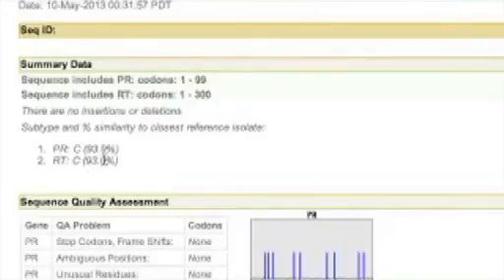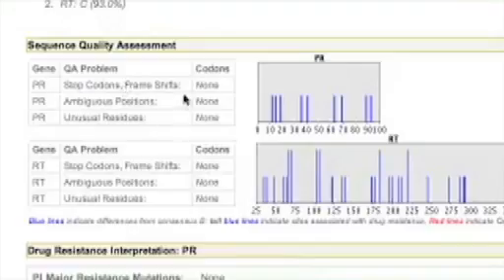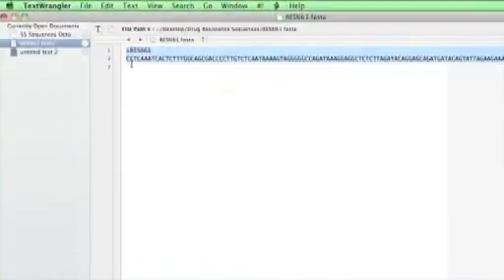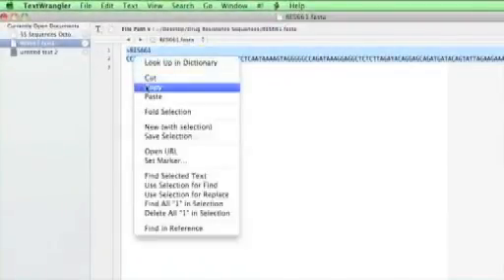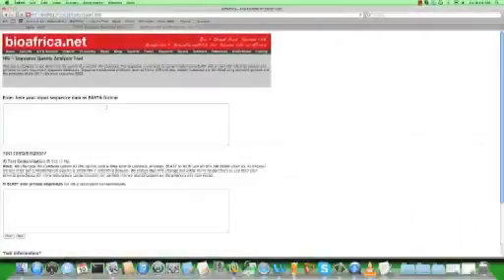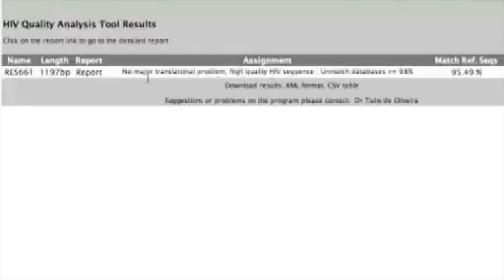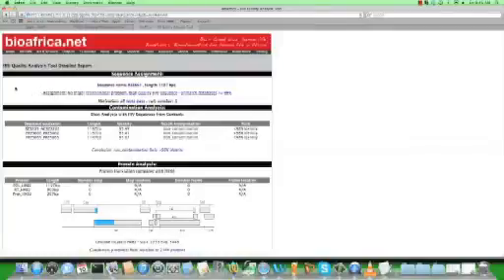Check for any highlighted QA issues in both the protease and RT regions such as stop codons, frame shifts, ambiguous positions and unusual residues. BLAST the new sequence against a local sequence database from previous runs. If the new sequence is greater than 97% similar to any of the sequence in the database, all the stages of the protocol should be reviewed, starting with sequence analysis going back to the RNA extraction to ensure that there were no mix-ups or contamination.